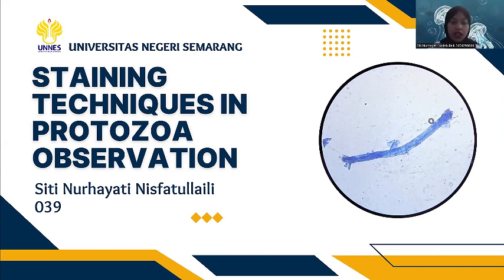This presentation summarizes the result of Practicum where we observed the effects of 5 different staining techniques on protozoan visibility under a light microscope.